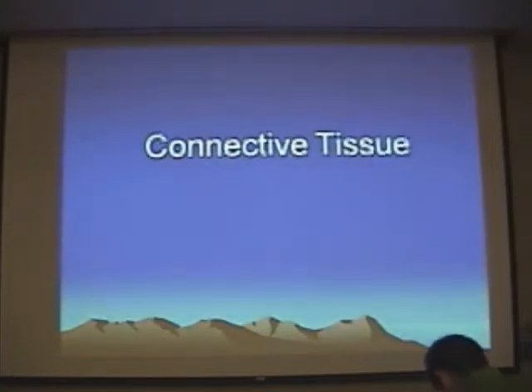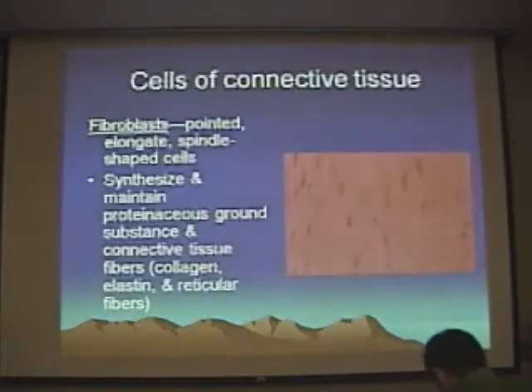So that brings us next to our major tissues, connective tissue. Yes? We need to know those different stages, the white blood cells? The question was, do you need to know those different stages of white blood cells? If you did, you are miles beyond anyone else in class. The answer is no.